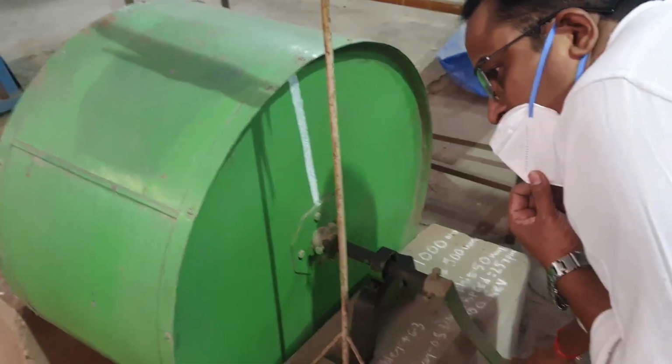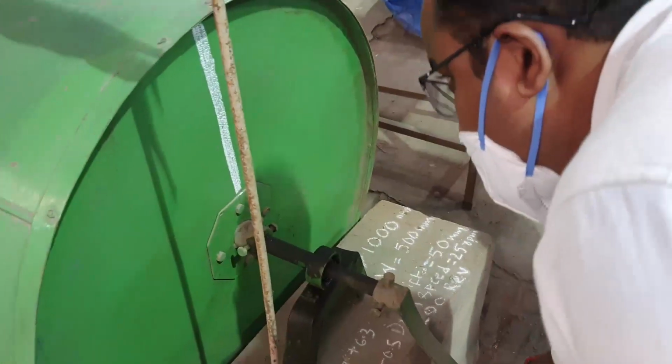Now we are subjecting it to 200 revolutions.